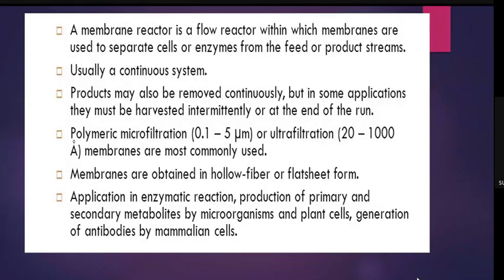So exactly, all the excess fluids which are not required will be removed from the reactor itself. Then the organism and desired products will be harvested from the reactor. So in order to minimize the downstream processing, they are going for this membrane reactor. This is its main use.